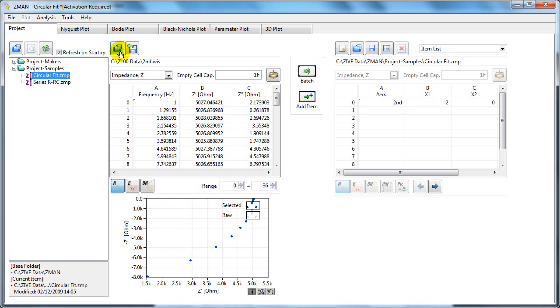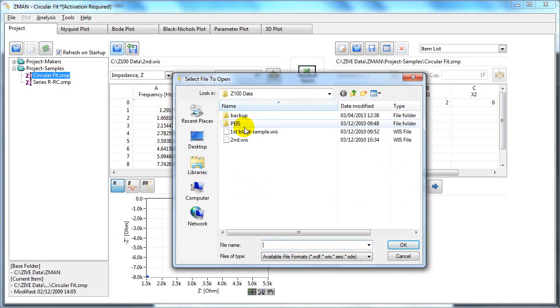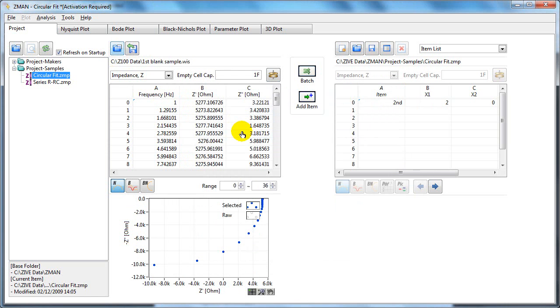If we want to add another one, we can go to find it here. For example, this first blank sample. It gets displayed here. And to move it to the analysis, you click add item.